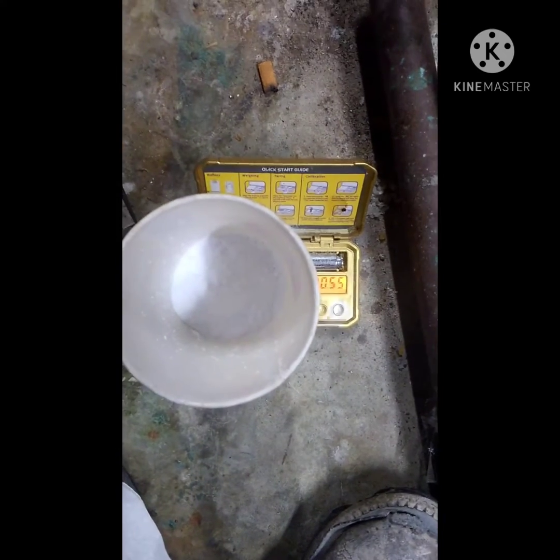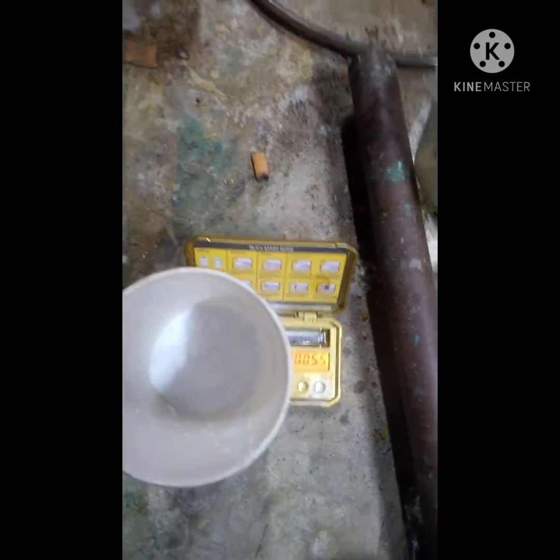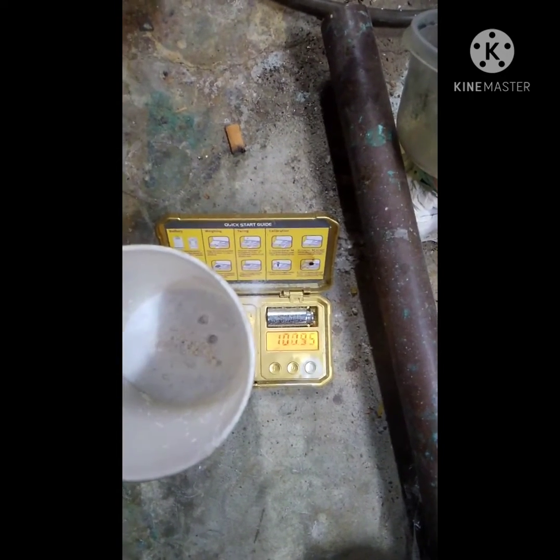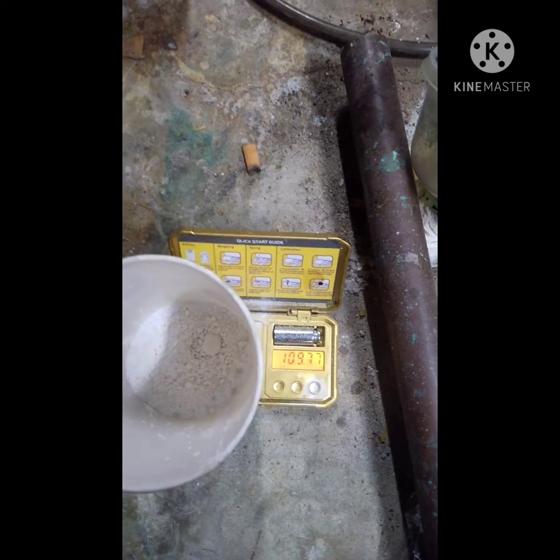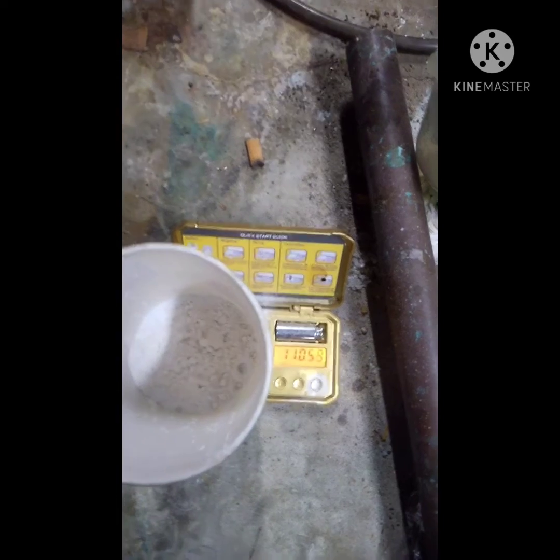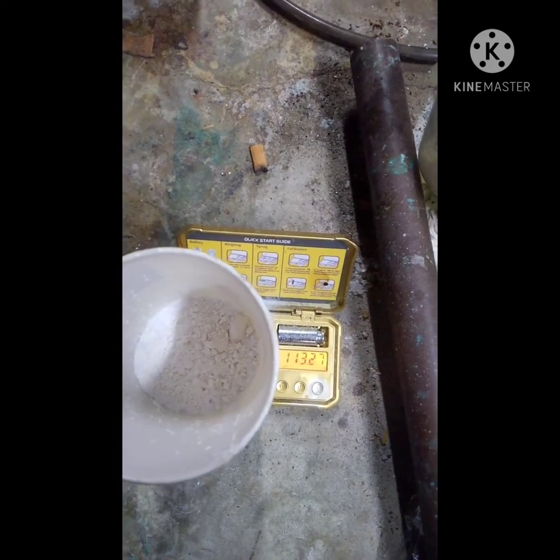We're going to blend it up to a powder and then add some gypsum to it. Alright, so I've got 100 grams in here of powderized silica gel, and now I'm going to add 10 to 15 percent gypsum.